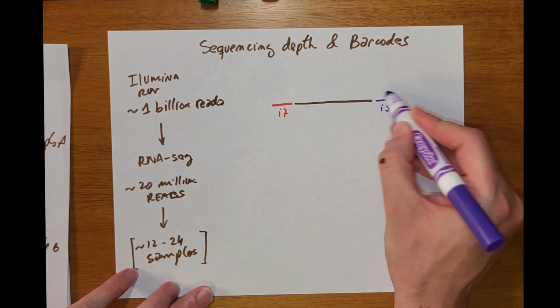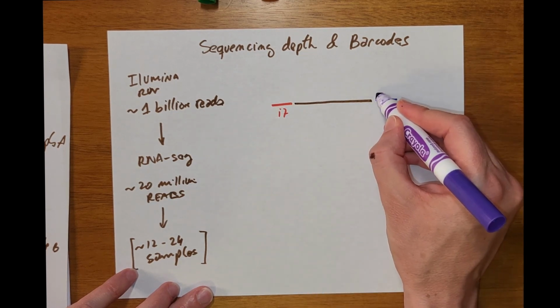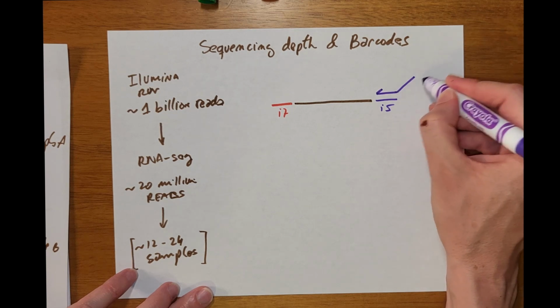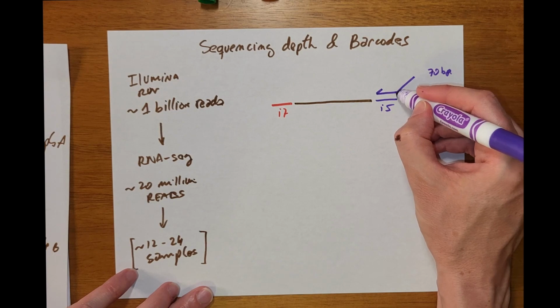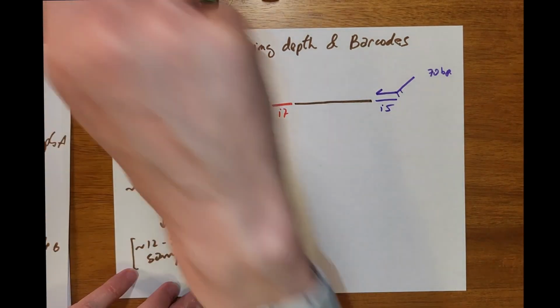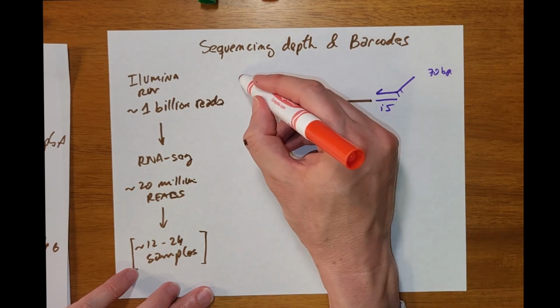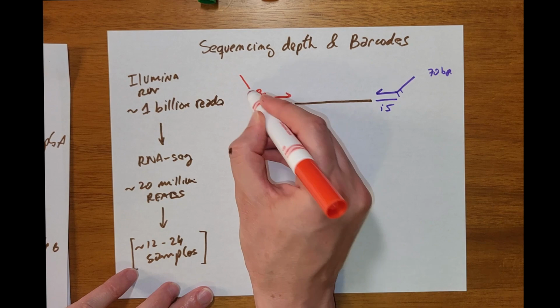Usually the first thing you add is the 3' of these primers. So you come back and amplify, do the PCR with a longer primer, around 70 base pairs now, that has a sequence here that can be variable. This is both for the I5 and the I7. So we have here a sequence where you can put the barcodes.